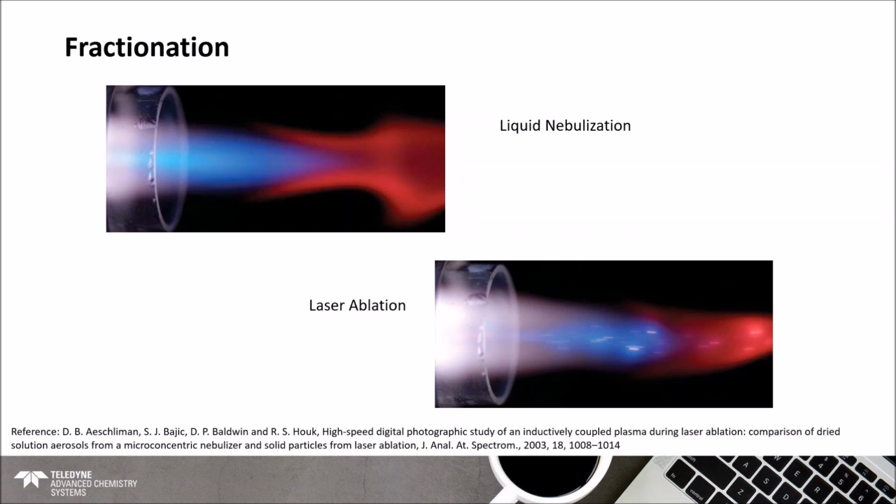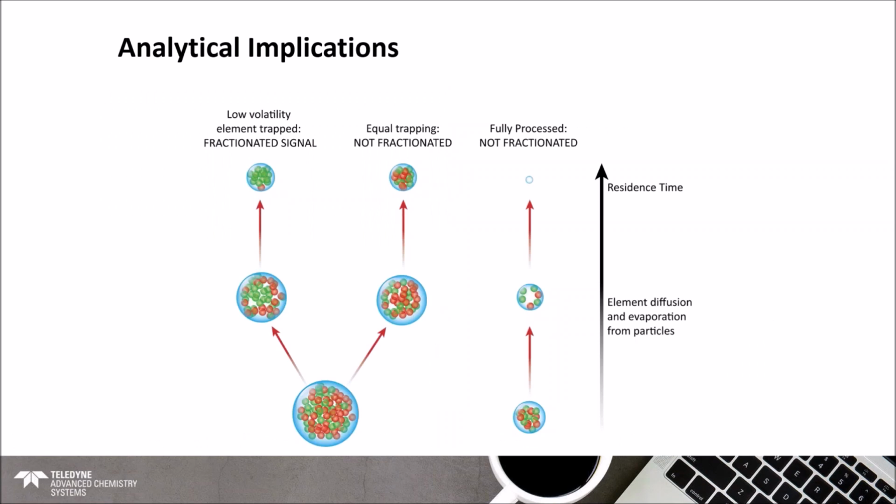Okay. Now, kind of furthering that, this graphic is intended to show exactly how that fractionation can occur and what I mean by the distribution within. So if you look at this large particle here on the left, we show it as kind of being split in a number of ways.